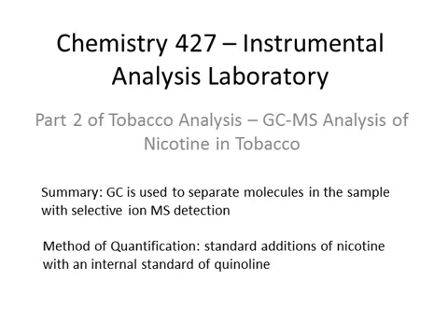And so nicotine, like caffeine, is a stimulant drug and it is addictive. Nicotine's negative health effects include increased rates of cardiovascular diseases, potential birth defects, and poisoning. And so in the report you can find additional references that will help you elaborate on some of the health effects of nicotine. The experiment consists of a GC separation followed by mass spectrometry of 4 selected ions.